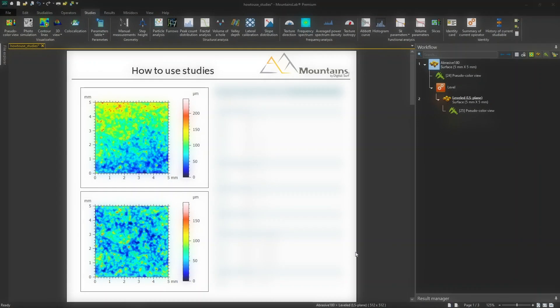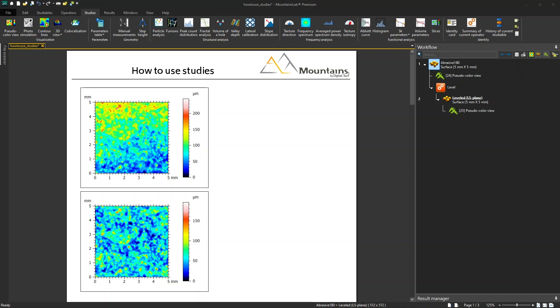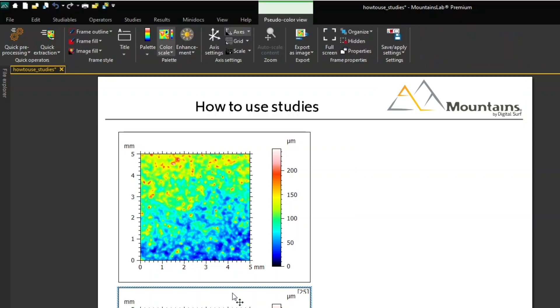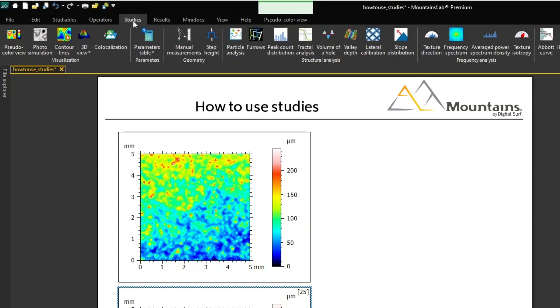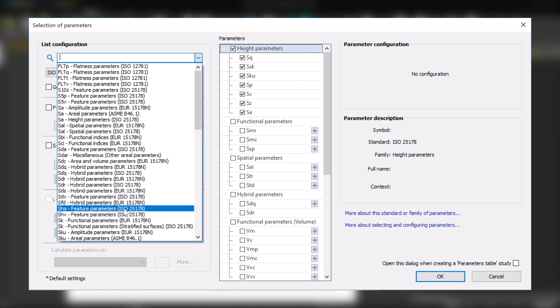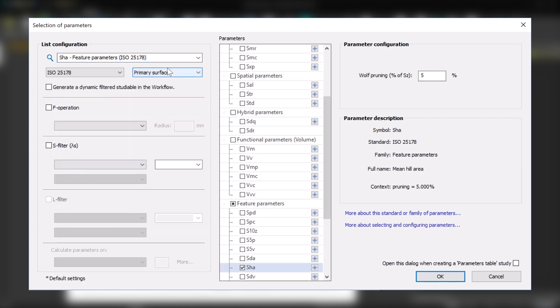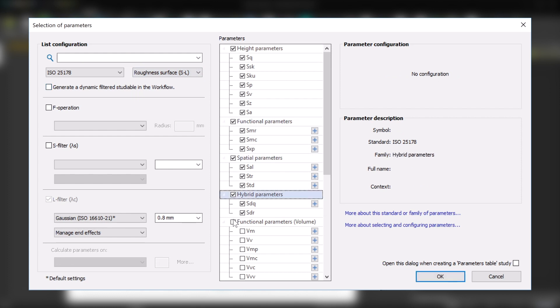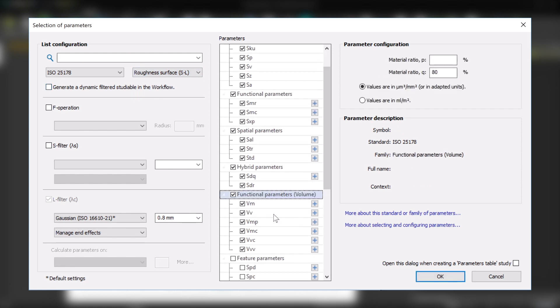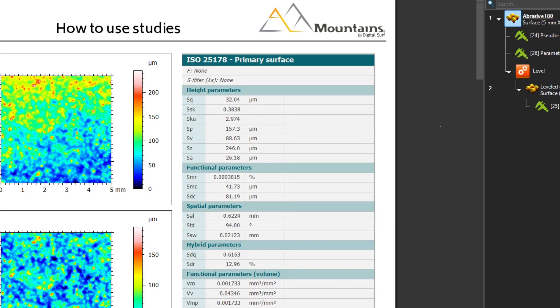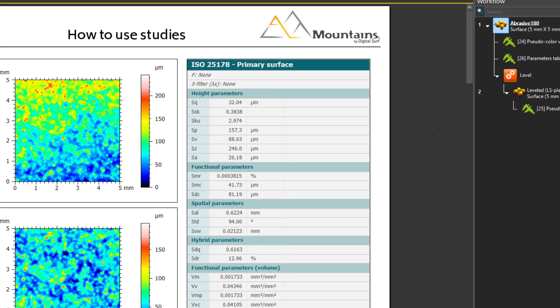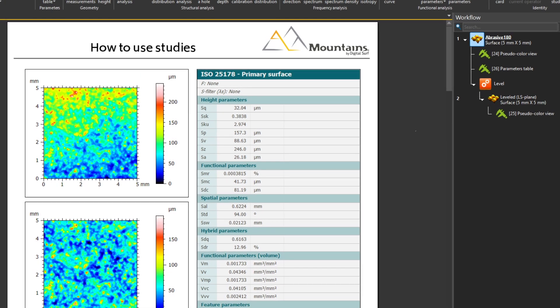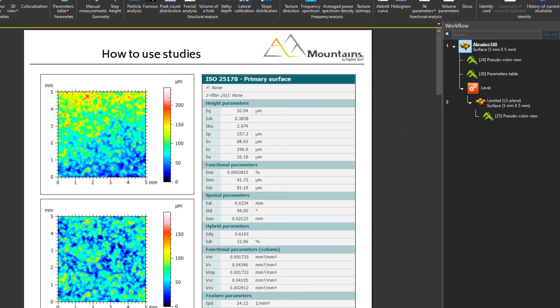To use it, just make sure you've selected your studyable, then click on Parameters Table in the Studies tab. A dialog opens showing all the parameters available. You can choose which group or groups of parameters you'd like to display, then choose which specific parameters you'd like to calculate. A table is generated in the document displaying the values previously selected.